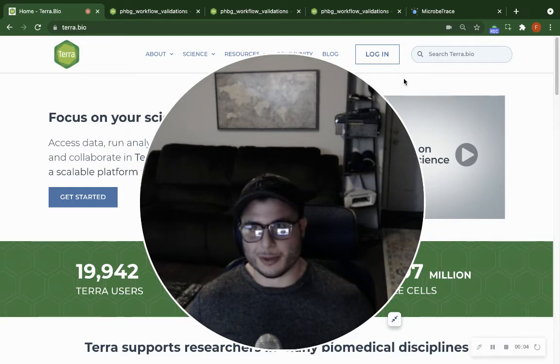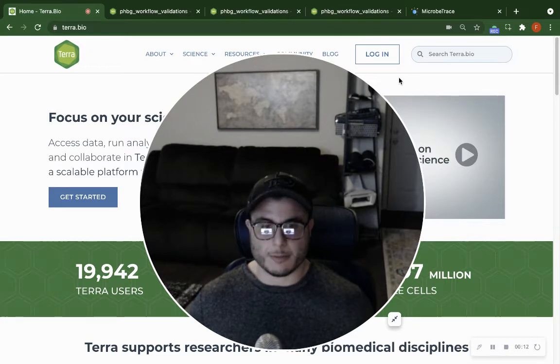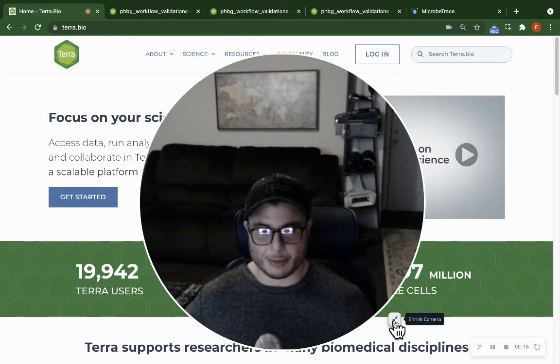I'm Frank Ambrosio with the Agent Genomics, and today I'll be talking about how to use the K-snip3 workflow on Terra.bio to prepare tree files for visualization on MicrobeTrace. So let's jump right in.